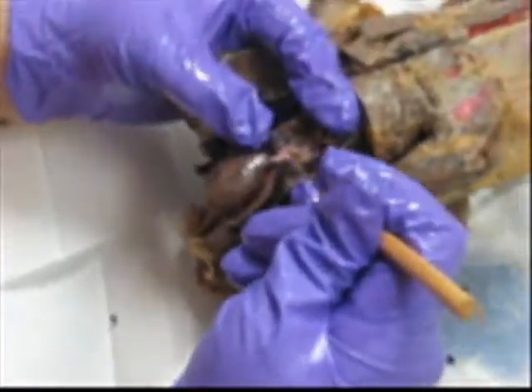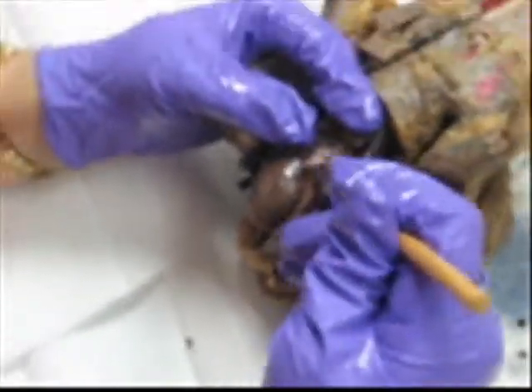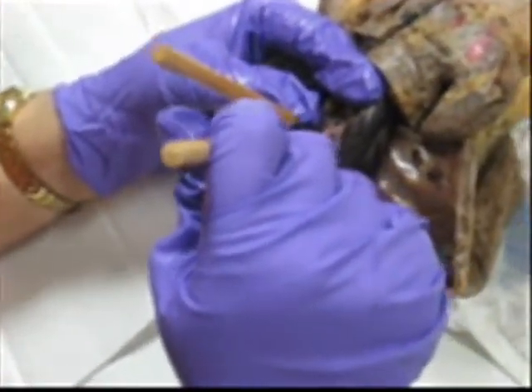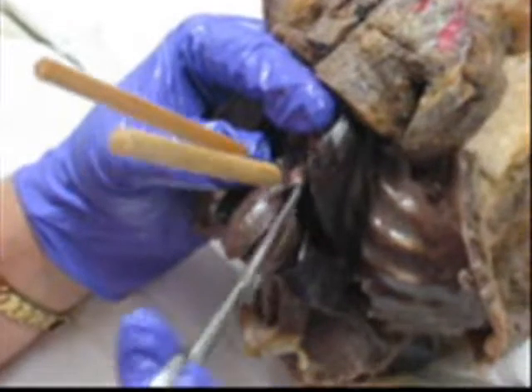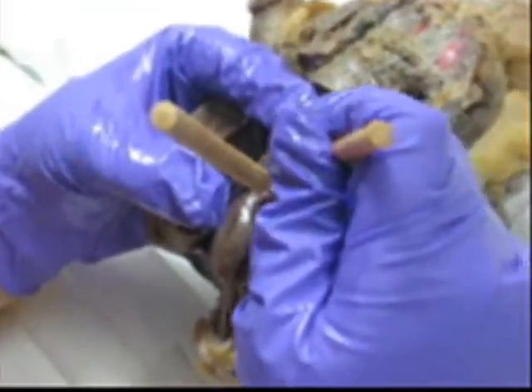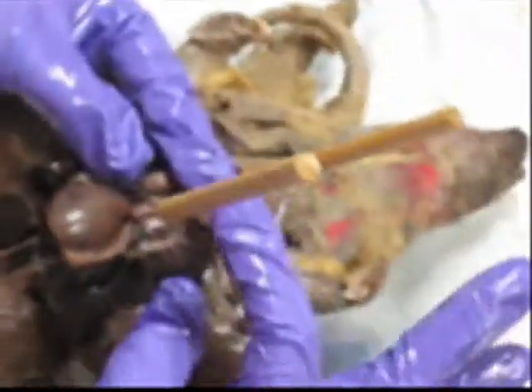So I'm separating it. If I pin right here — right there is the ascending aorta. Next to it is the pulmonary trunk. Over here, ascending aorta; over here, pulmonary trunk. And if I pin further out — aortic arch.